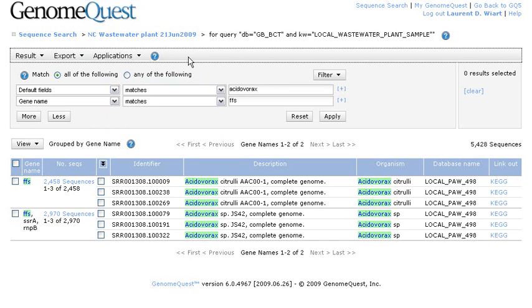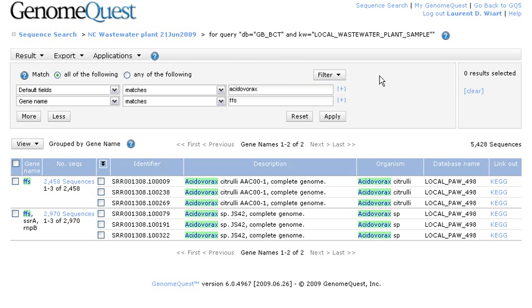So, to conclude, we have been covering the rapid annotation process that enables the automatic annotation of millions of 454 and Sanger reads in a matter of hours. And this is available in the GenomeQuest platform. And that's pretty much it for today. So thanks for your time. Bye.